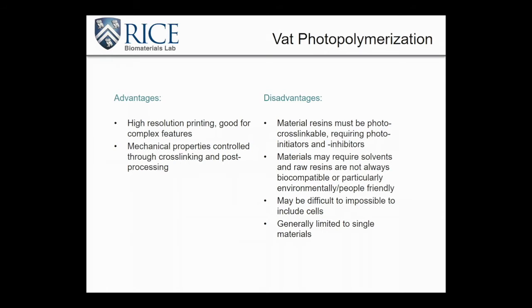One other thing that we didn't talk about is while with inkjet printing and with extrusion printing you can use different heads, it's really complicated to print an object in Vat Photopolymerization that uses different materials. Because you're using a single vat, you have to physically switch out that vat every time you want to use a different material, and often that's not possible to do during a print and even to accommodate that efficiently.